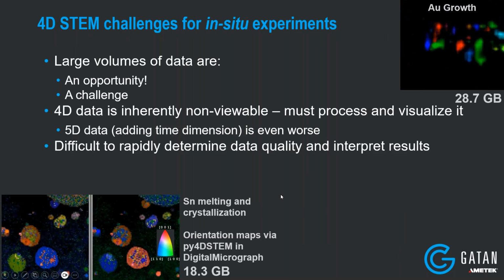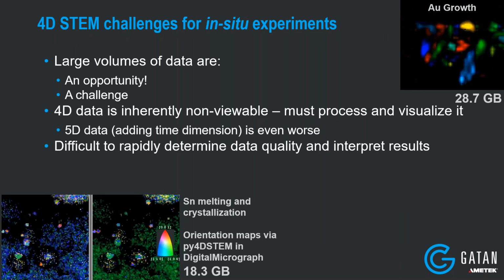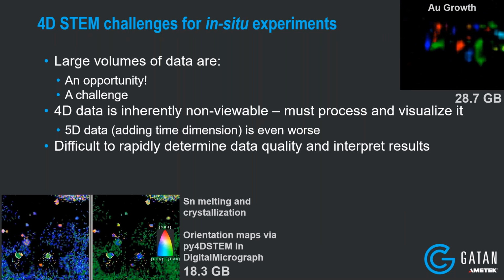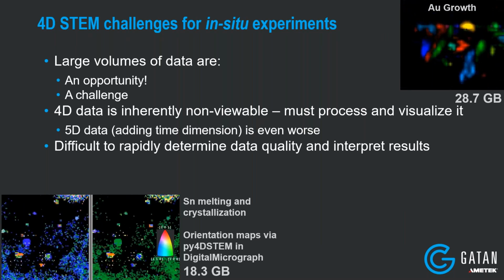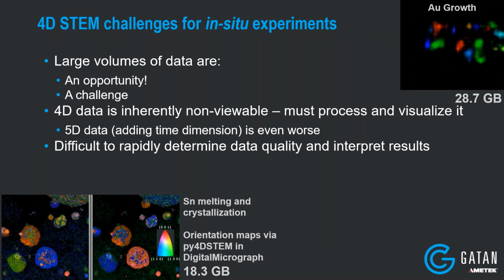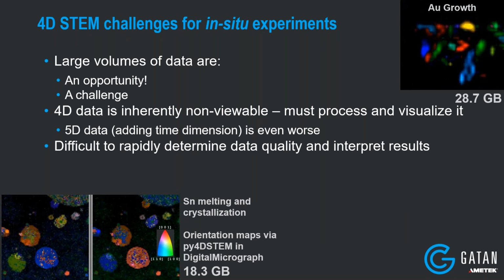Another challenge is that four-dimensional data is inherently non-viewable, right? I cannot look at a four-dimensional object on my two-dimensional monitor. I have to process and visualize the data somehow in order to display a four-dimensional data set on a two-dimensional screen.